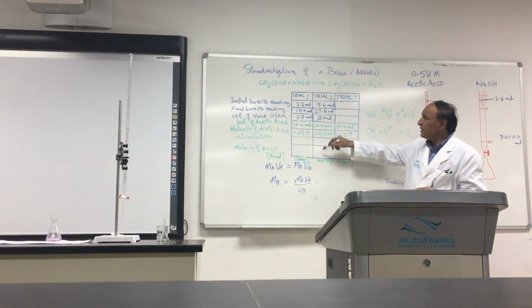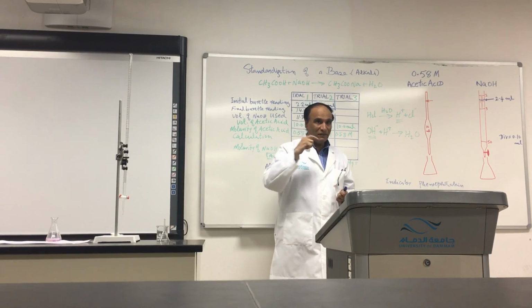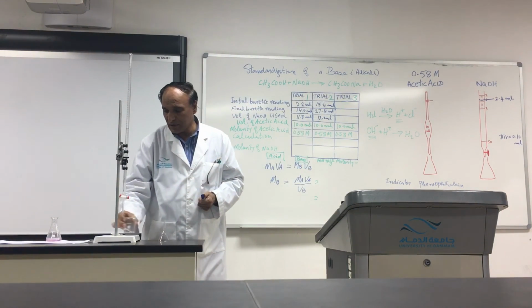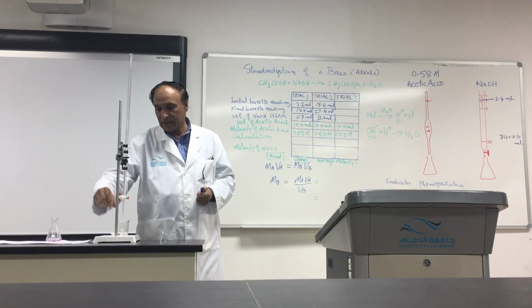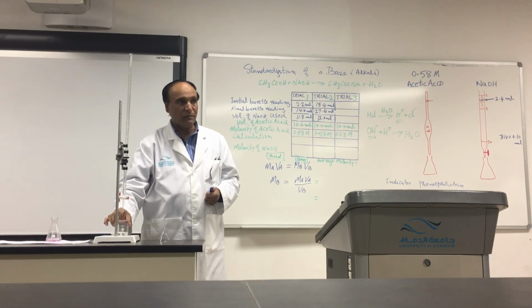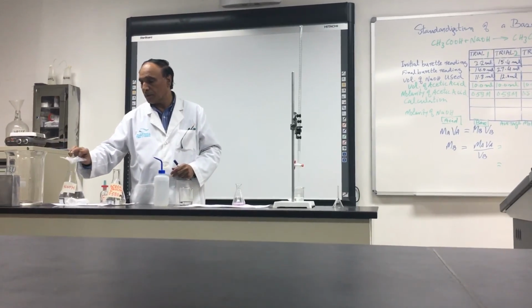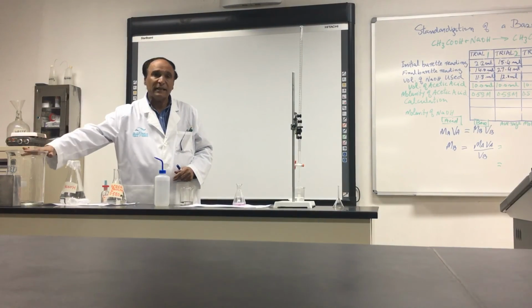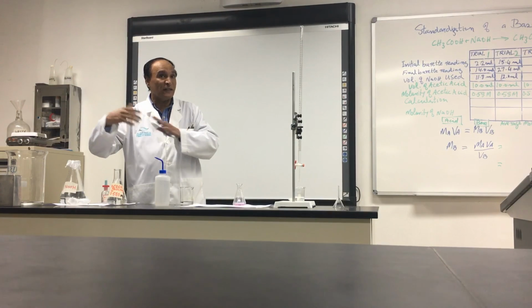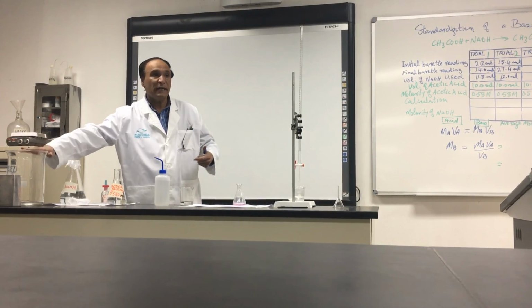So look, did you understand how to fill this one? I will tell you how to do the calculation, because next time you have to do it yourselves. Return this sodium hydroxide back. In the small beaker there is sodium hydroxide, right? I will not put it back into this one. I will put it in another container and recycle it, make it useful for the others. Maybe there is some contamination, so I will put it in another beaker.